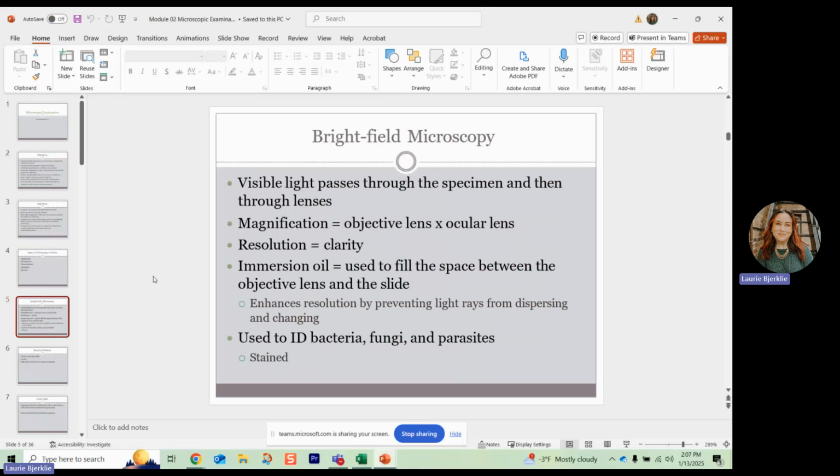In the microbiology area, anytime you're using something that's stained, we're typically using 100x for the stained. 40x would be looking at something like a urine that's not stained. So there is a little difference there. But again, to come up with the total magnification, it's your objective times your ocular power, and that's the total magnification.